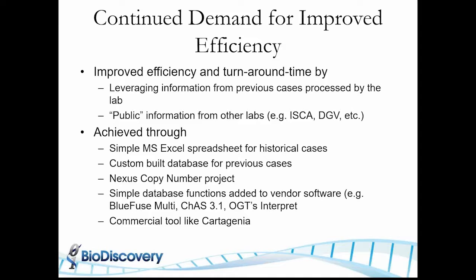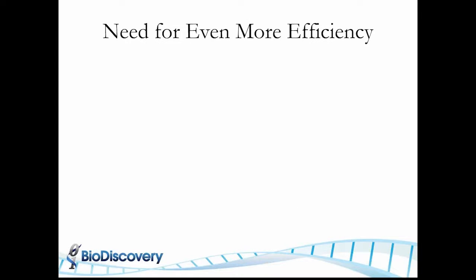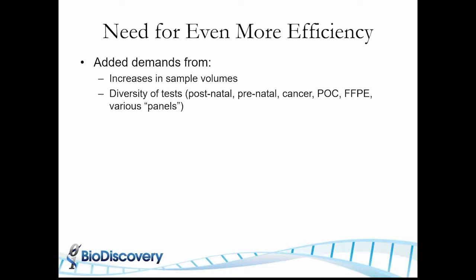There is no analysis component to it, but just housing the previous cases. So that was one solution to improving the efficiency, but more efficiency is needed because there are added demands. So the number of samples, the volumes is increasing, the diversity of tests is increasing.